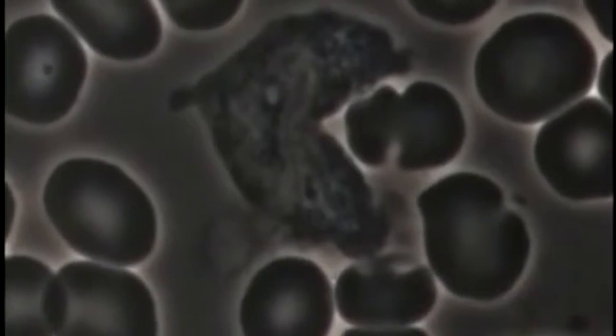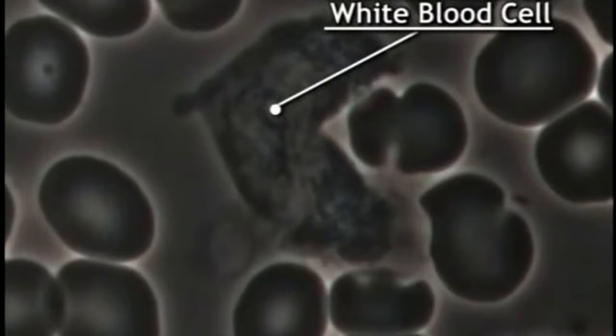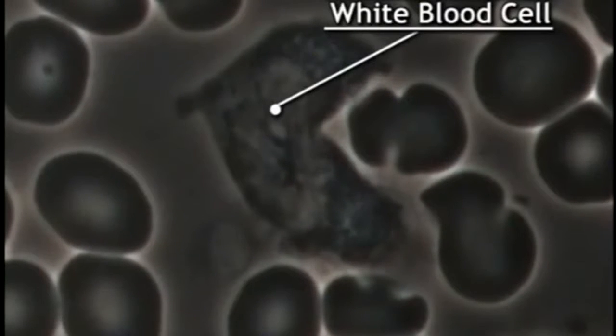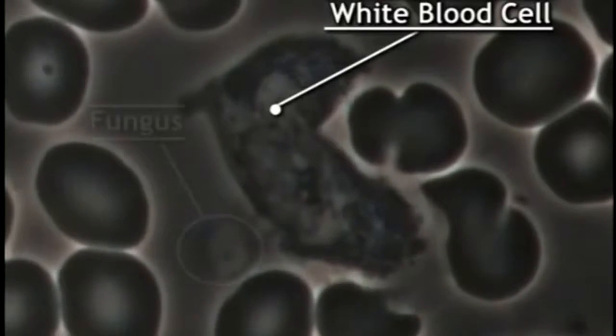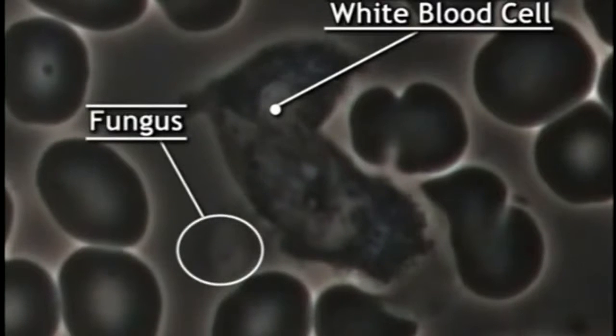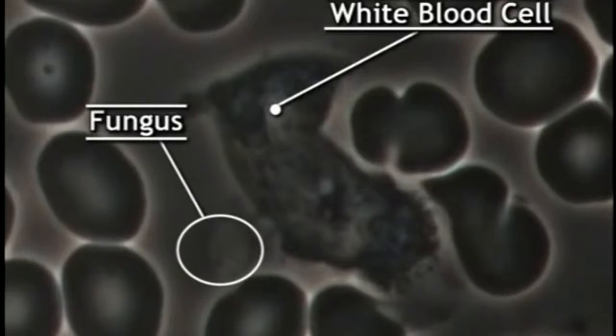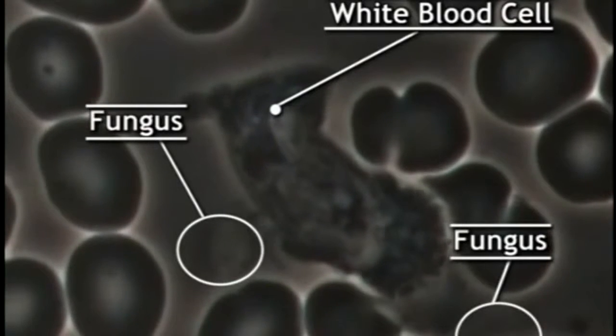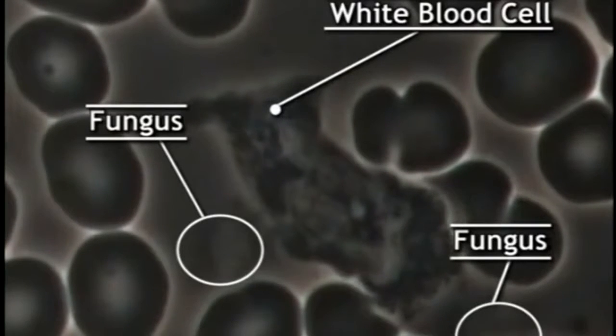This is a healthy white blood cell after taking goji for approximately 10 days. It's touching this red blood cell very closely. It recognizes that it's part of itself. It doesn't attack it. But then there's something else down here. This is a fungus. This white ball is not supposed to be there. This is another fungus cell. They're rather large compared to the bacteria that are floating in the background.